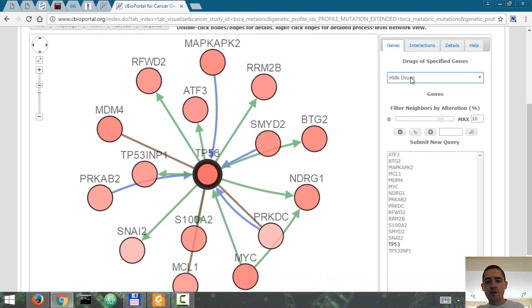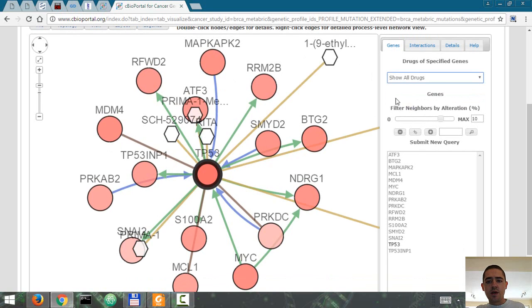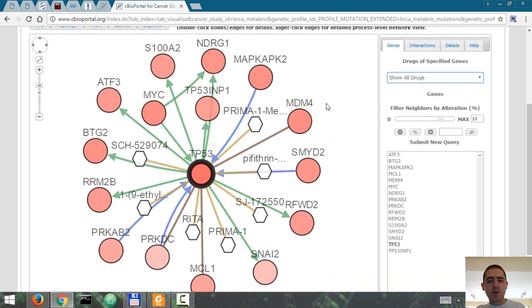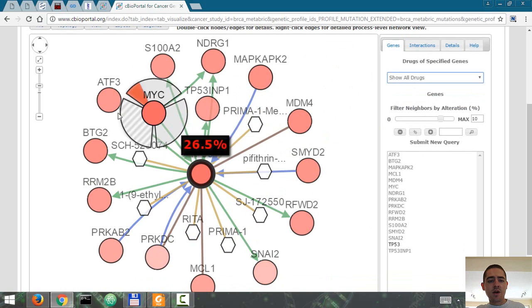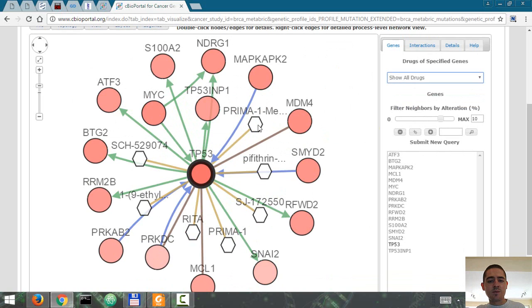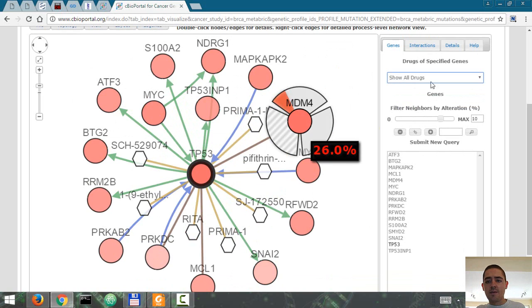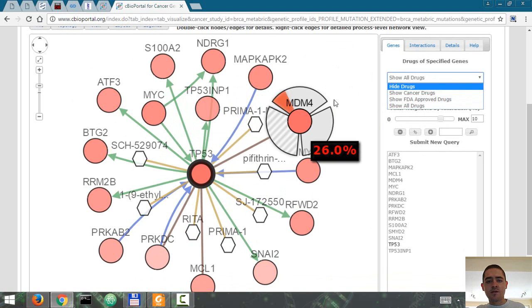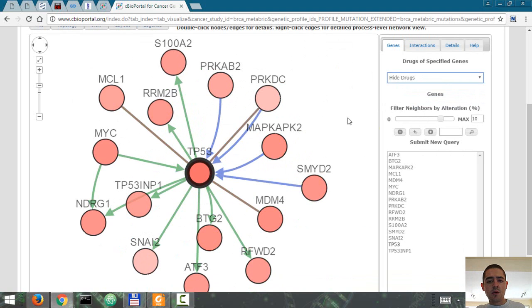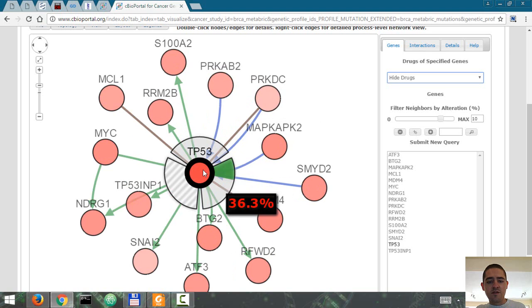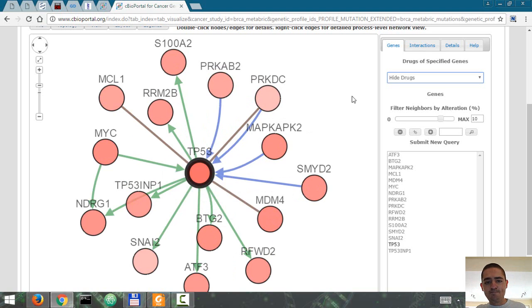You can also show all drugs and it will show you which drug, either approved or not approved, acts on a specific pathway, but we're going to hide the drugs for now. So P53 is mutated in 36% of the cases.